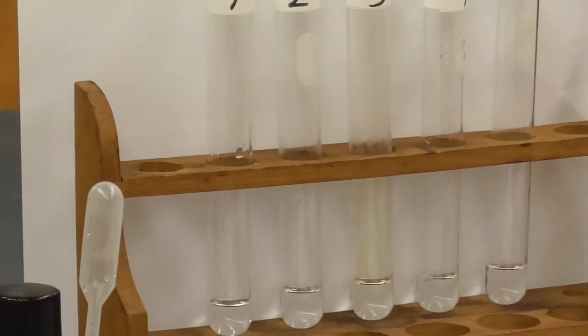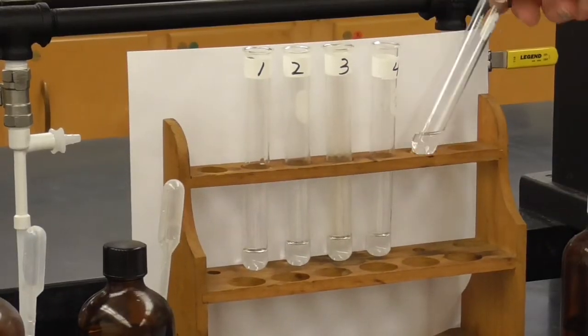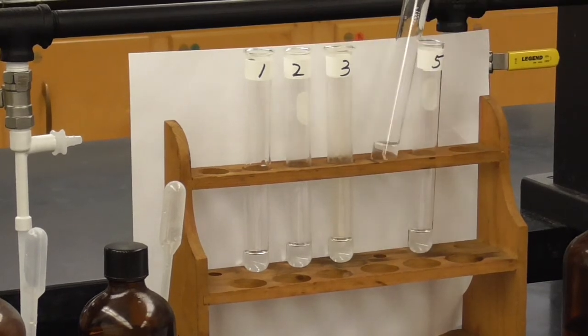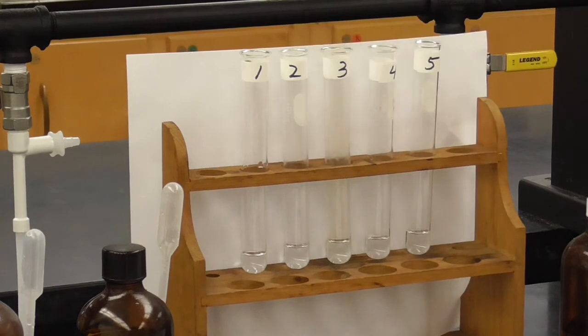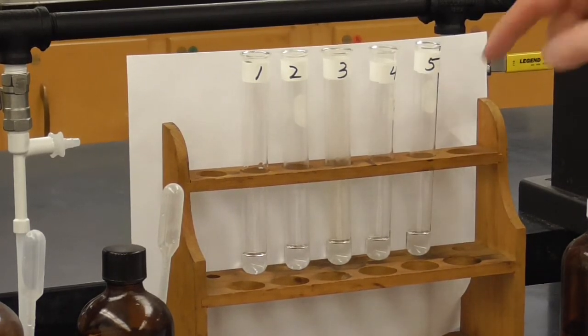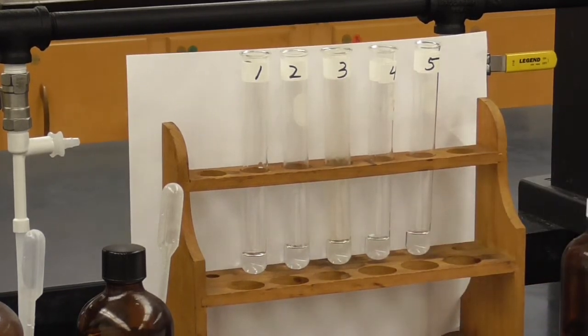Actually, I think we're pretty much done. Let's see. This one has no metal left. This one has just a little microspeck left. All right. Actually, I don't see anything now. There's just a little bit left, and this one's still going. The other 4 are all dissolved, so no more metal left on those.